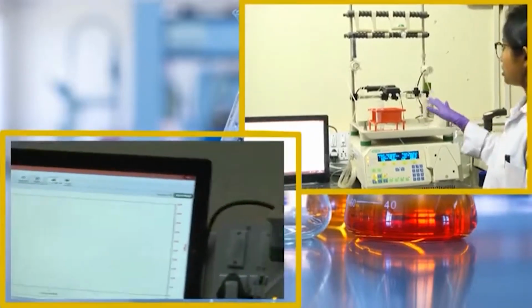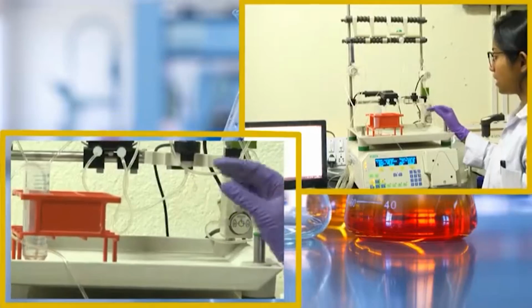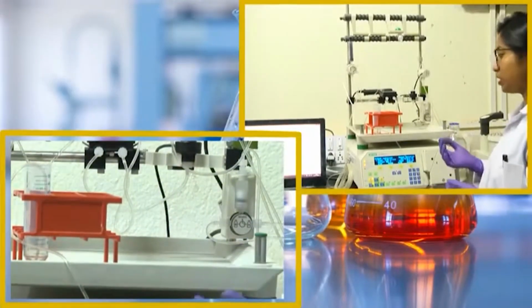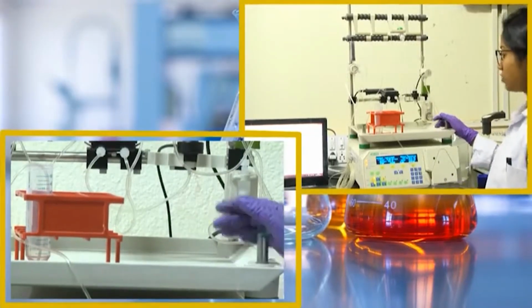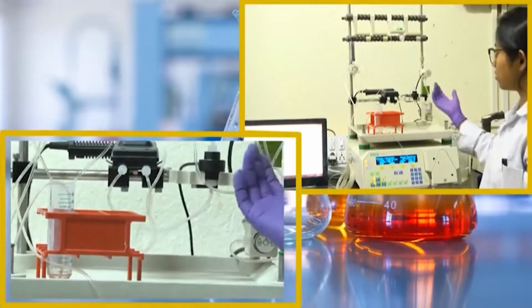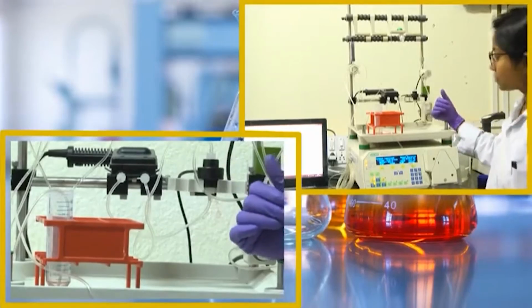So, right now water is passing and it will clear out any kind of alcohol that is present or any kind of precipitate. The last time someone used this particular machine, there might be some salt precipitation or other components which might have precipitated out inside the tubings as well as in the column. So, it needs to be cleared out properly.